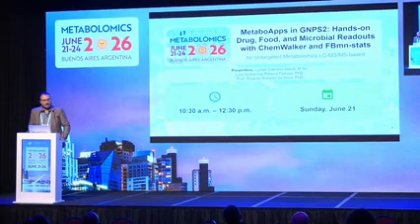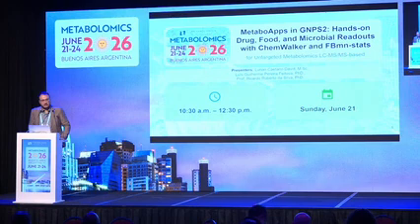This is going to be the MetaboApps in GNPS2. It's going to be different from some of the workshops this morning if you attended some of the other ones, because the idea is really a hands-on experience. I'm going to show the examples that are already loaded in the server of those tools so that we gain some time instead of loading your own data. But the idea is that you keep asking questions, doubts, and also some suggestions you can send me later too.